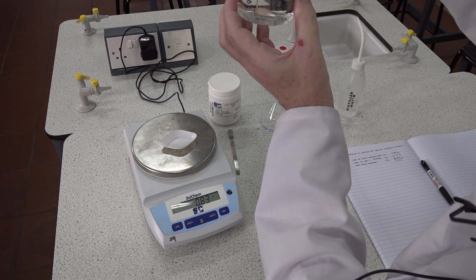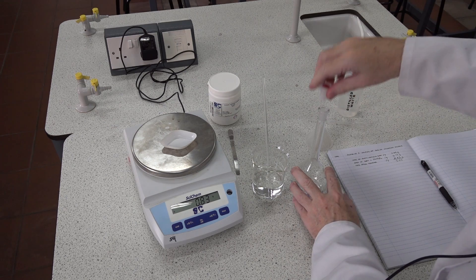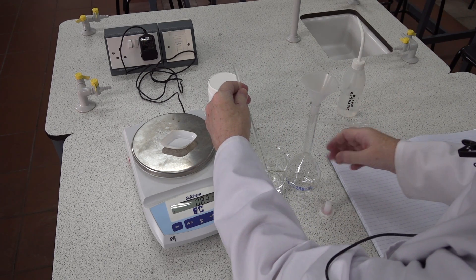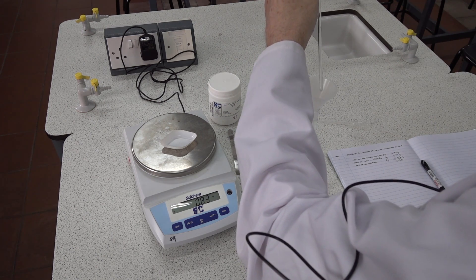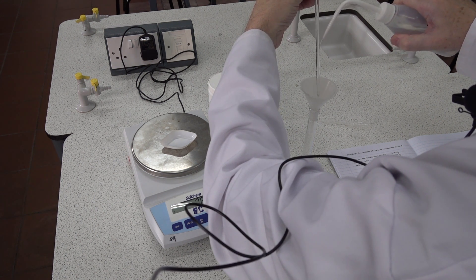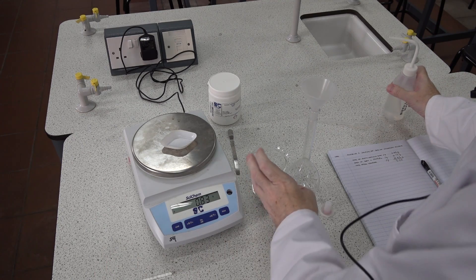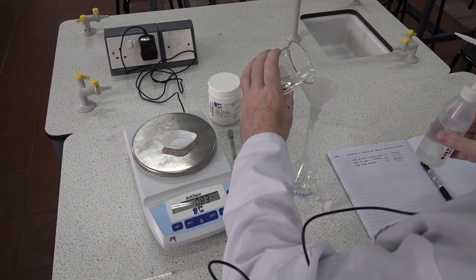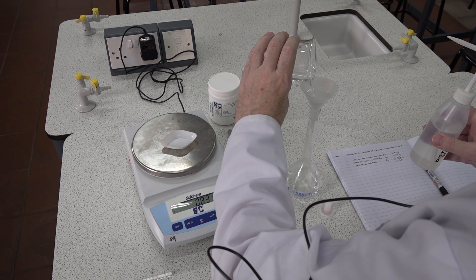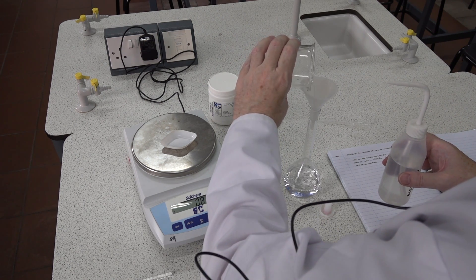Finally the salt has dissolved. The next stage is to transfer all the solution into the volumetric flask, and we need to wash all the equipment we've used. First, let's start with the glass rod — replace the wash bottle and be careful not to touch the tip of the wash bottle onto the equipment. There, we've washed the rod. Next we can tip the solution into the flask.